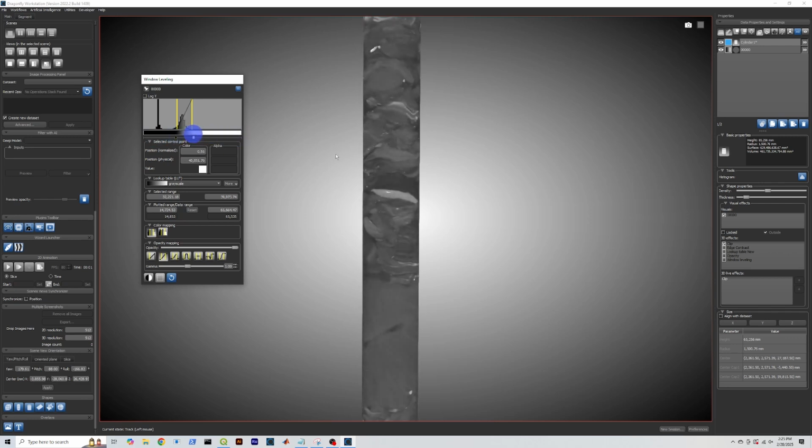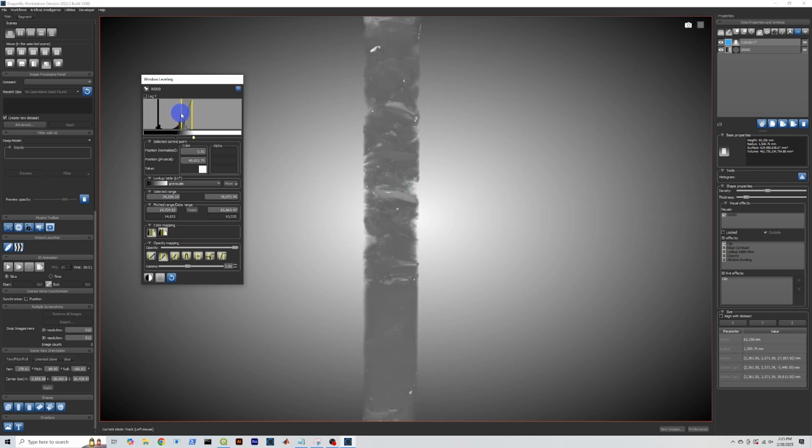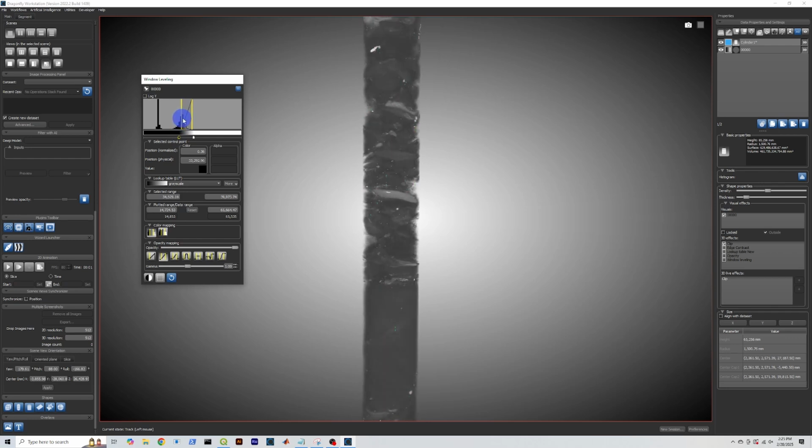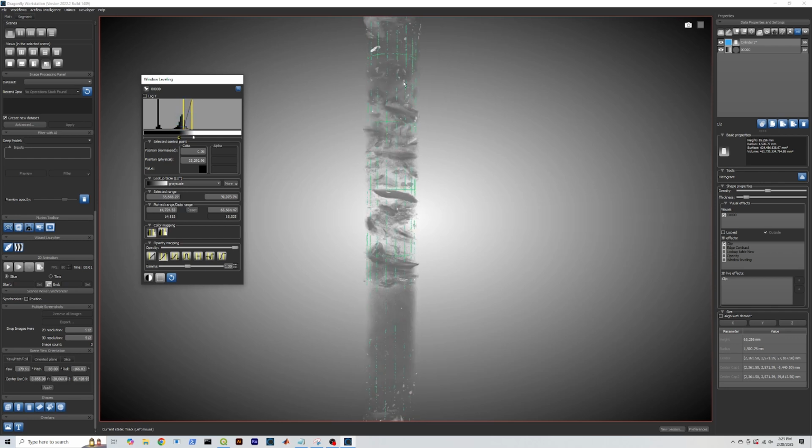Ooh, nice, looking better. Okay, okay. And so now, if we move our opacity mapping, we can see, okay, now we are only looking at our high density class, and everything less than a certain threshold has been removed altogether, but we still see the wireframe of our cylinder here, and so let's just toggle that off, so now we don't see it.